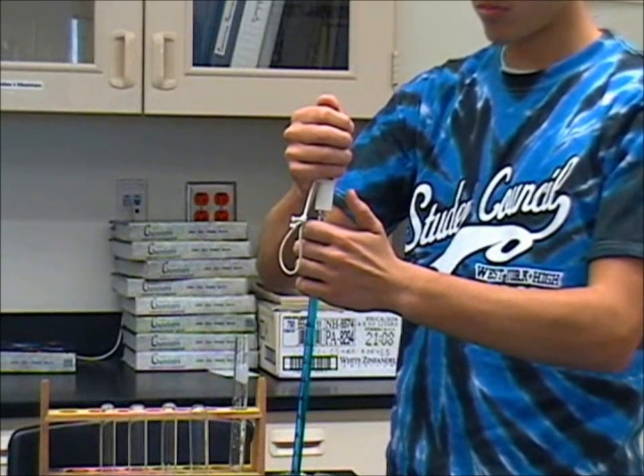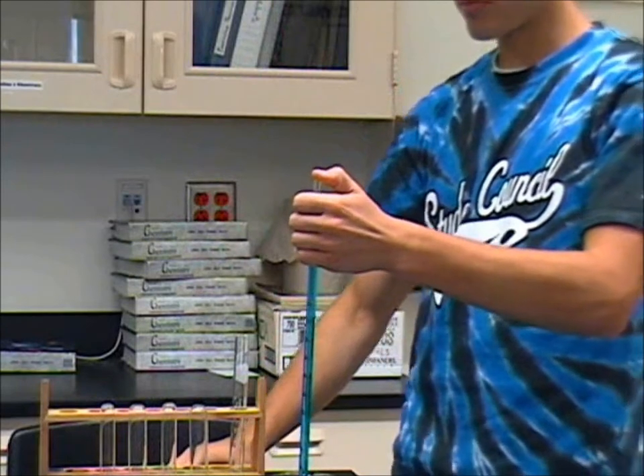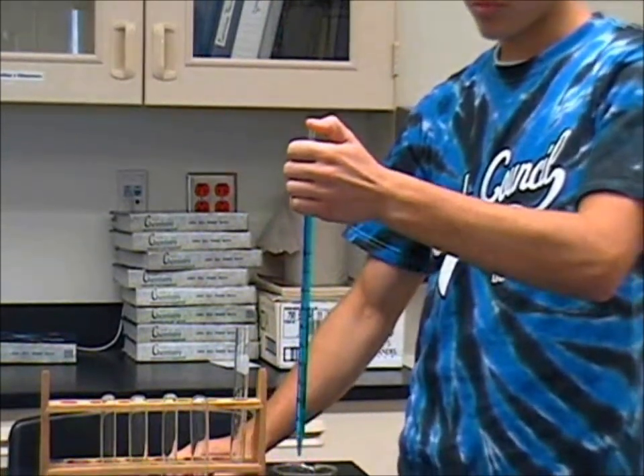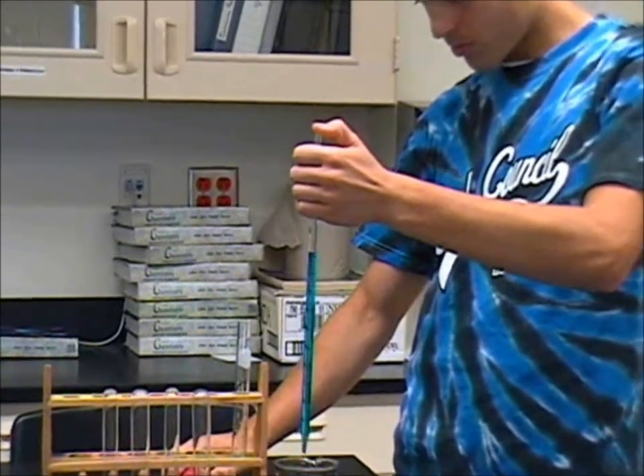Quickly remove the bulb with the opposite hand and place your thumb on top of the pipette. Move your thumb slowly in order to release as much solution as needed. Make sure you have the proper measurement before transferring.